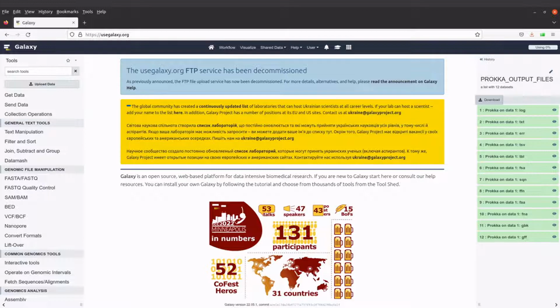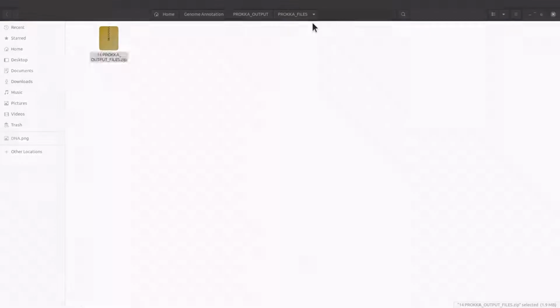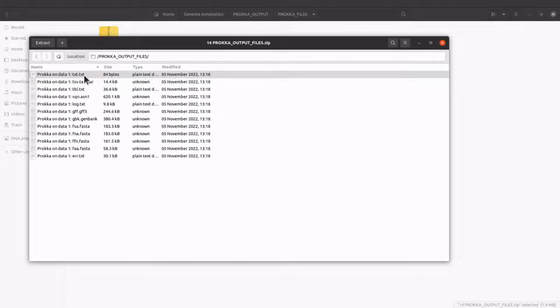and then I am going to explore it. So let's go and explore that particular file. So now it has been downloaded. Now let's take a look at the file. This is the file. It's a zip file, so I can open it and then check the contents.